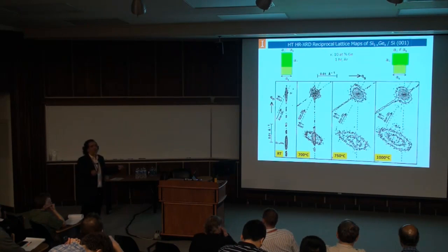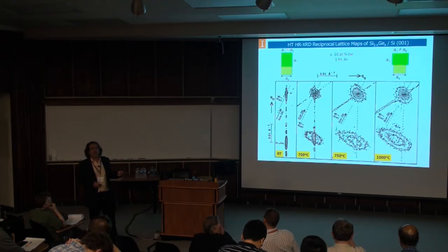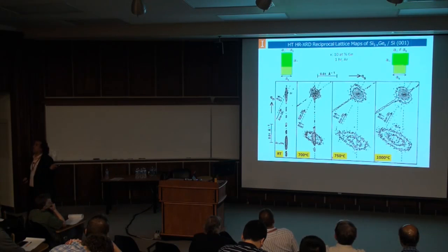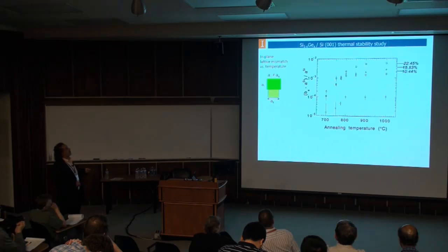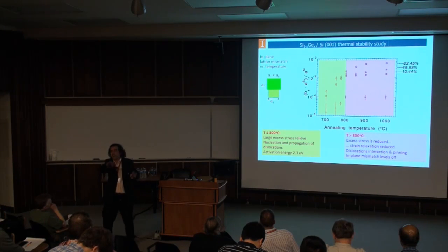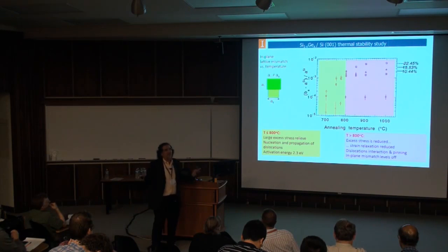And it's party time. You can calculate things from there, defects, density, and so on. You get a lot of information. You have to agree with me. You will get much more information from this kind of result than from the simple scan. You can actually get direct lattice constant measurements in multiple directions as well. And of course, we extract kinetics from that. We could interpret the data and see what is going on with the dislocations. In a nutshell, you start annealing, and dislocations and defects go crazy. They start propagating very quickly.